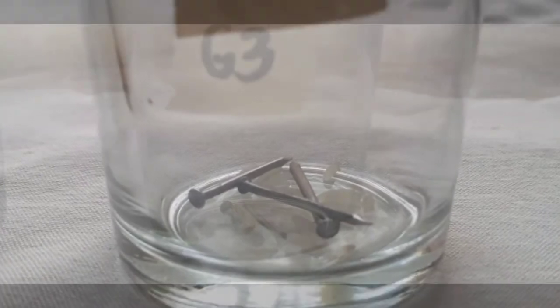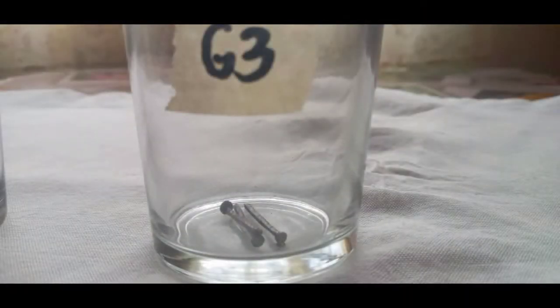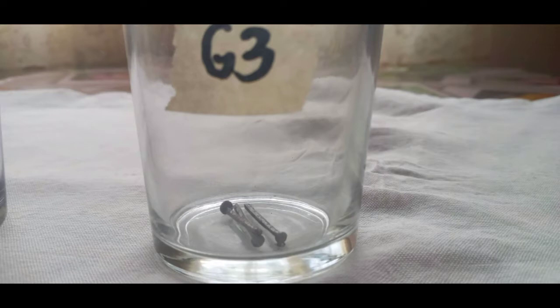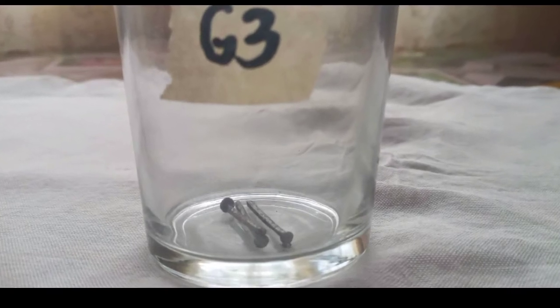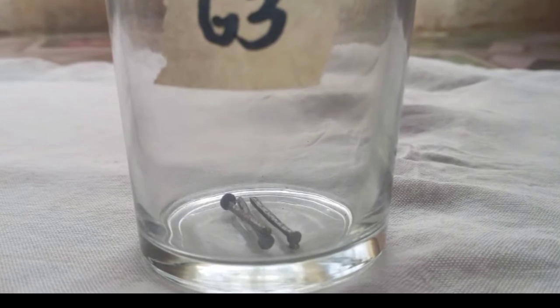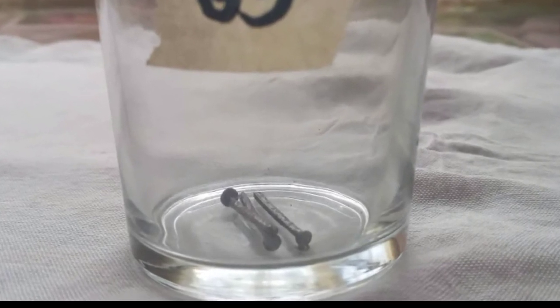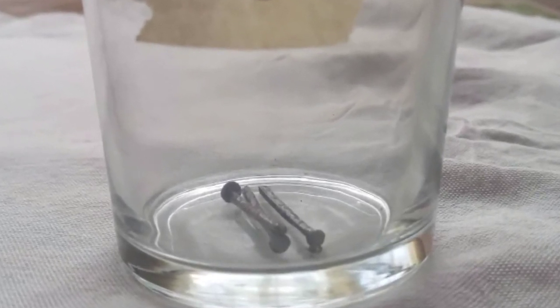Glass 3: The nails do have rust, but not that much. It looks like patches of rust that is evident on the nails. The grey color of nails were still visible. And this setup, no liquid added.